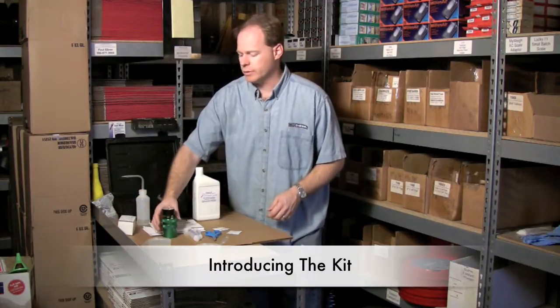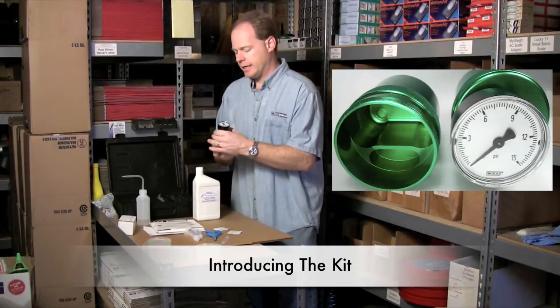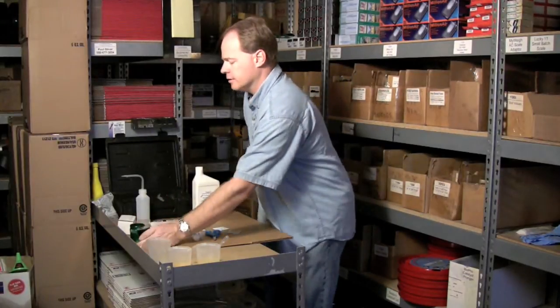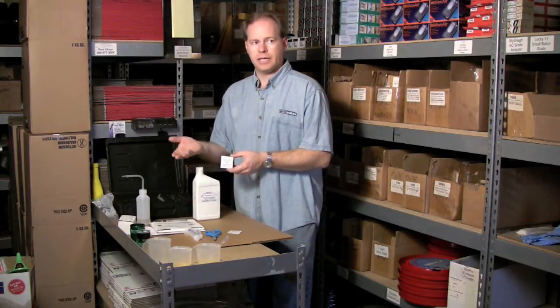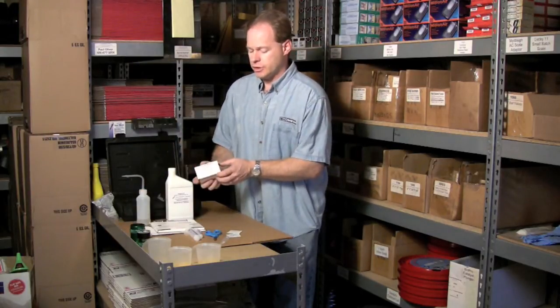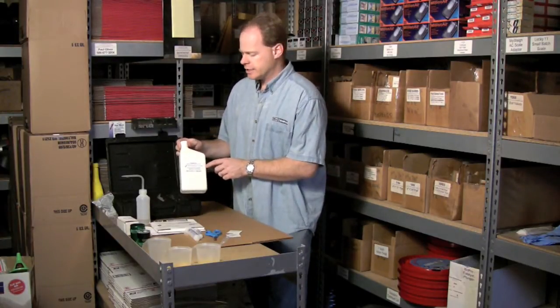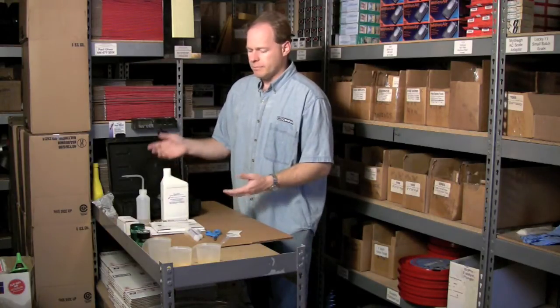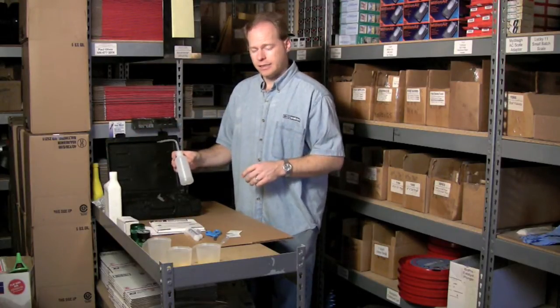This kit comes directly from Sandy Bray Laboratories. It comes with the testing vessel — it's got a gauge on top and inside is where you'll actually do your sampling. It uses a chemical called calcium hydride to react with hydrogen in water, which produces a gas, which produces pressure, which is how you take your reading. It also comes with 50 individual packets of the calcium hydride and some solvent — basically equivalent to paint thinner — which we mix with the oil to do the test. It also comes with a nice little clean-out bottle.